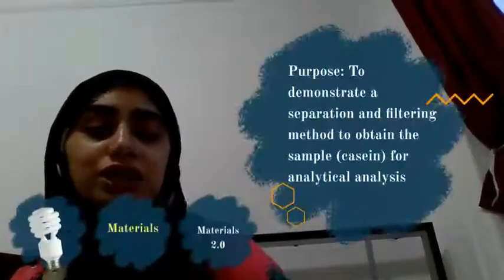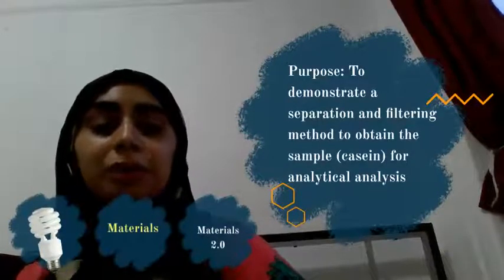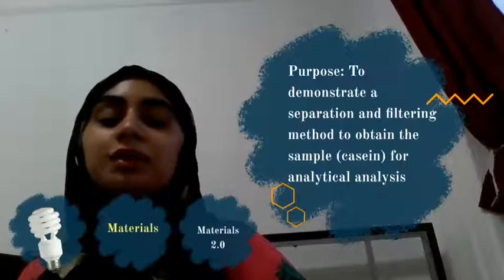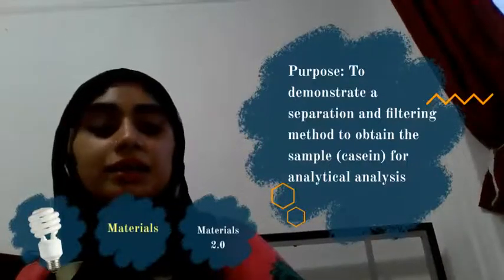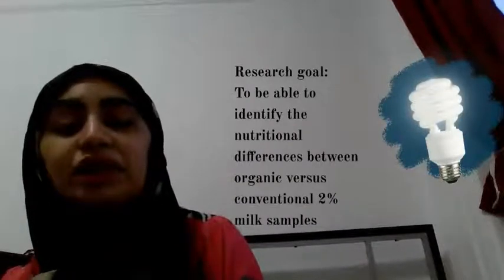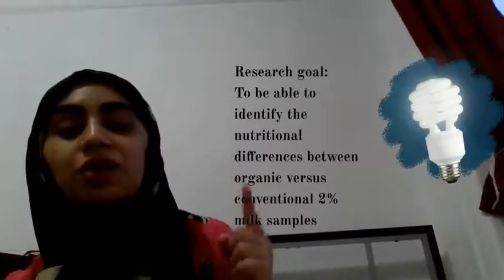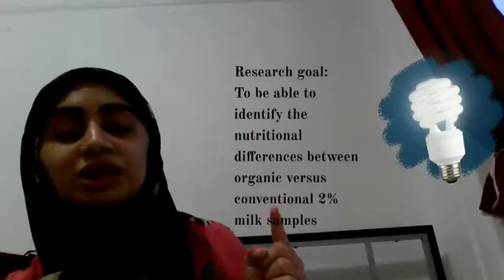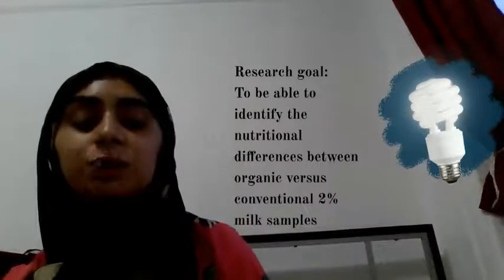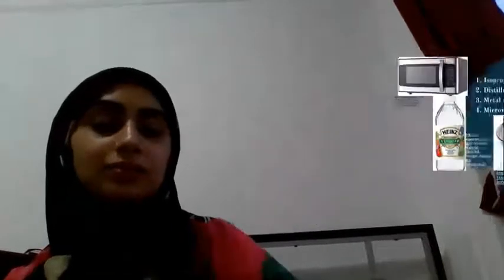Let's look at the research now. So the purpose is to demonstrate a separation and filtering method to obtain the casein, also known as the milk protein, for further analysis. My research goal is to be able to identify the nutritional differences between organic versus conventional 2% milk samples. Both of the samples will be 2% fat.